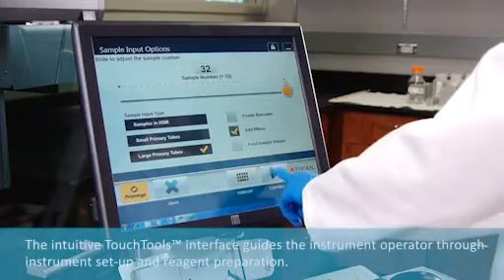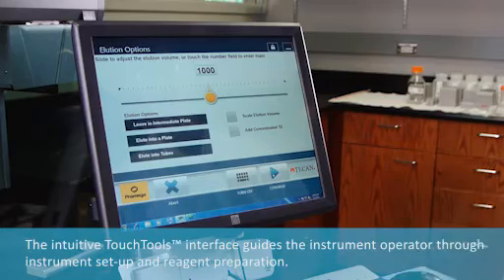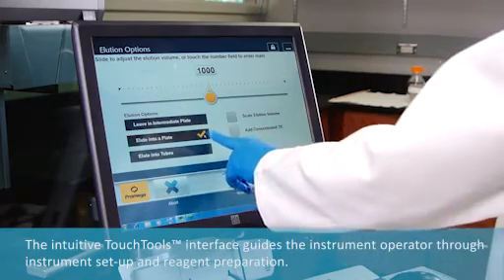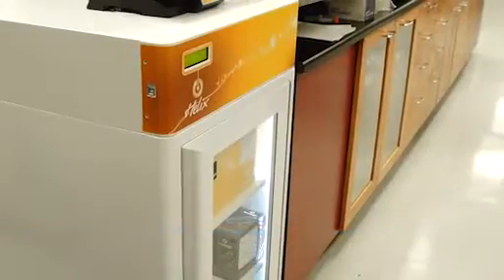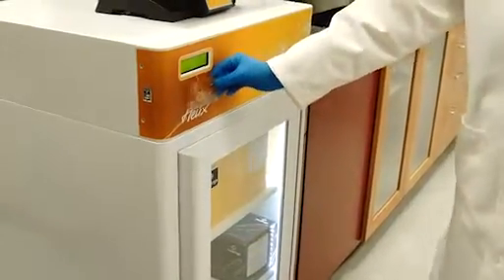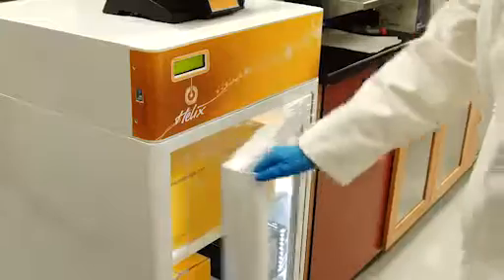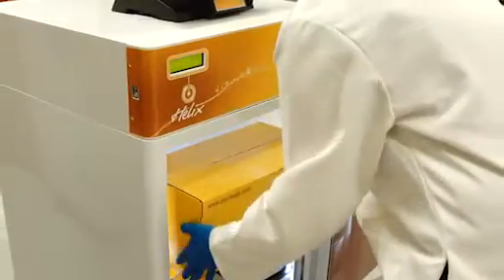The intuitive touch tools interface makes setup easy and efficient, guiding the operator through instrument and reagent preparation. An on-site Helix stocking solution simplifies reagent acquisition and inventory management.